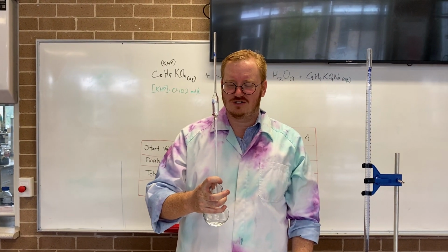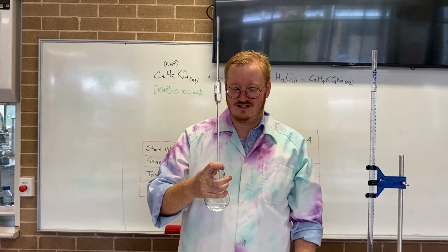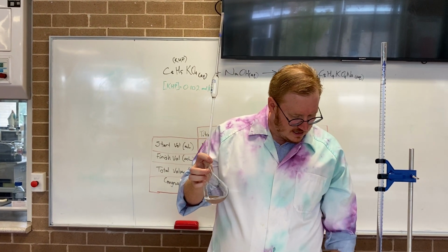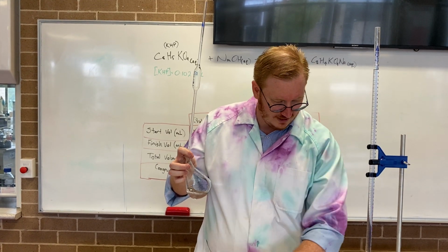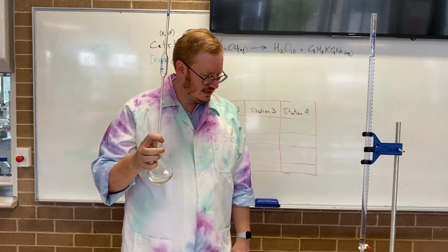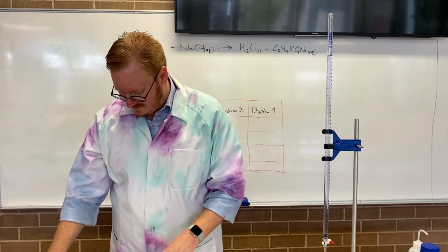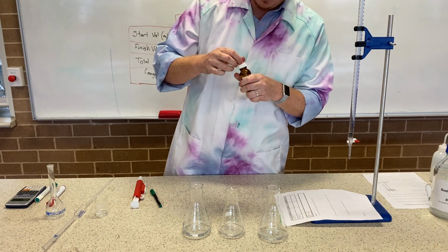If you're ever not too sure, just a drop of phenolphthalein will tell you, have you got an acid or a base there? If you've got a base, it'll turn pink. Letting this last one drain down, and then we'll add our indicator in. Then we need some white paper underneath here because we're looking for that slight pink endpoint. What else do we need to do? We've got our start volume. I think we'll be all set after that. All right, count a couple more seconds. Okay, there's my 25 mil. And phenolphthalein indicator, because we're going to have a slightly basic endpoint.